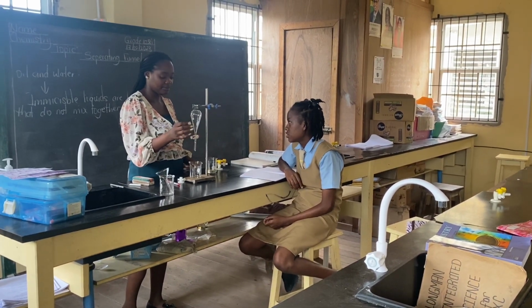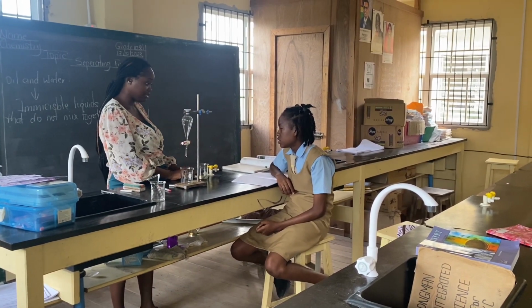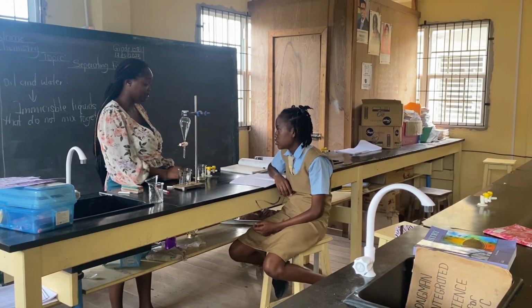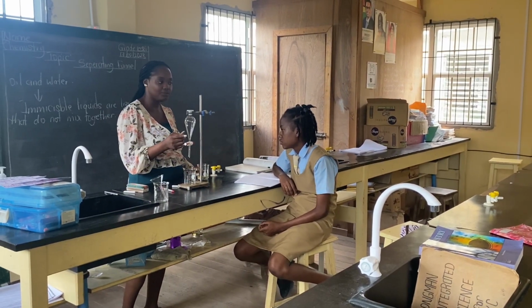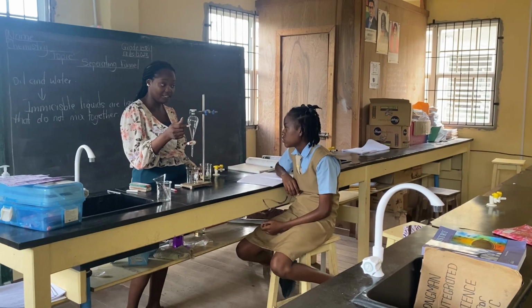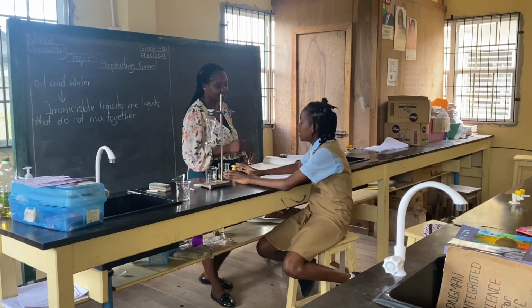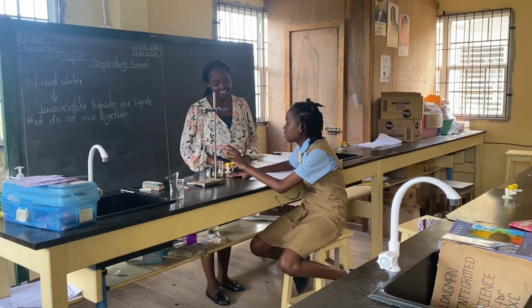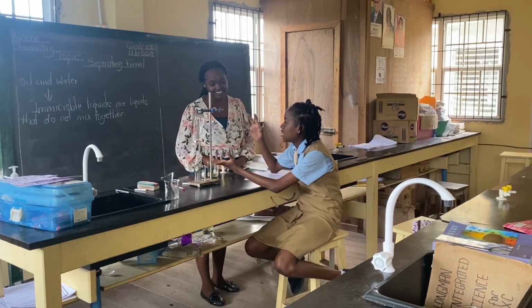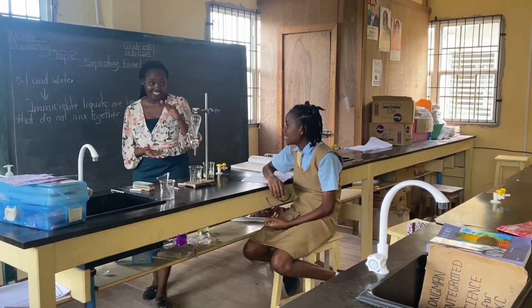Yes. Alright, so it's going to switch position in relation to how it is here. Because the water is at the bottom. So in the beaker, our water is at the bottom, but you're saying when we add it to the funnel, the water will be at the top of the oil? Yes. Why do you think? Because this is a beaker and it's a flat surface, and this is a separating funnel. Because of the fact that it's hanging, yes.